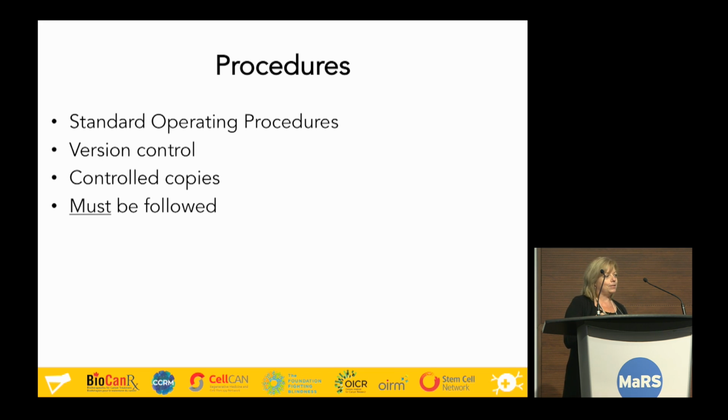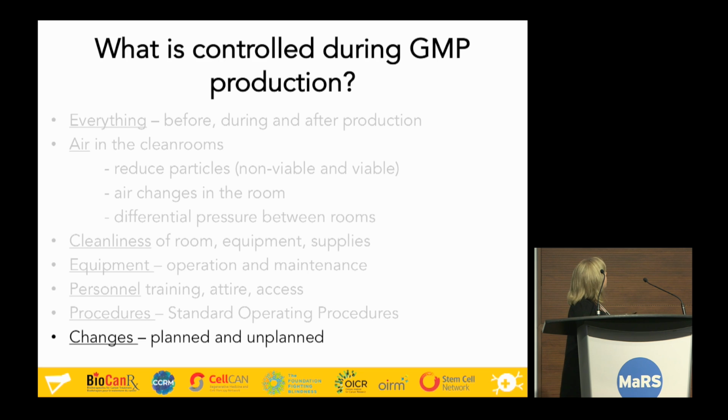I have worked in research labs where you have a procedure and people kind of follow it. Some people don't even really know they're there, but here we have to follow them. Procedures for everything. Like I said, an SOP for writing an SOP for mopping the floor. It isn't just SOPs for the scientific part of it.